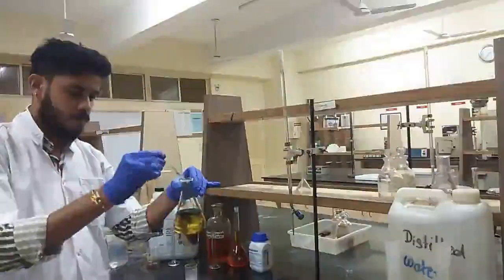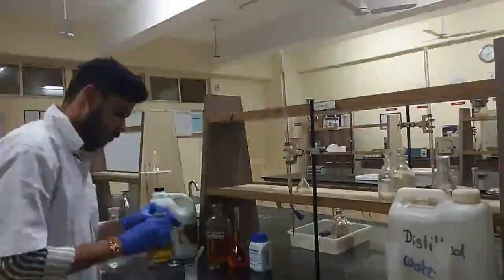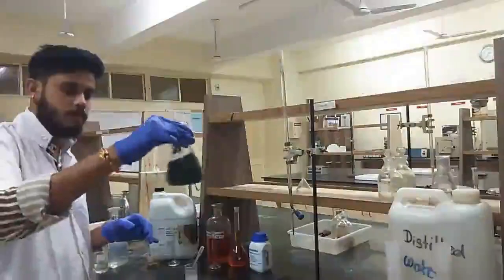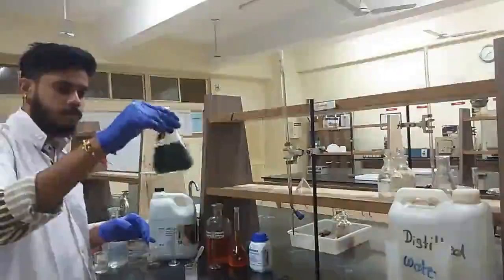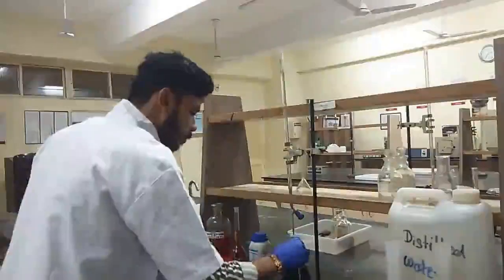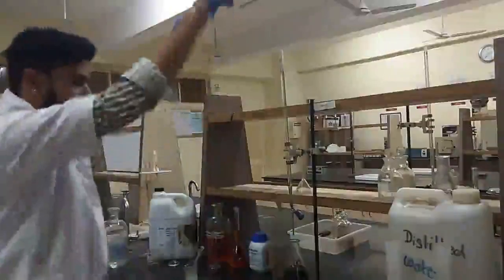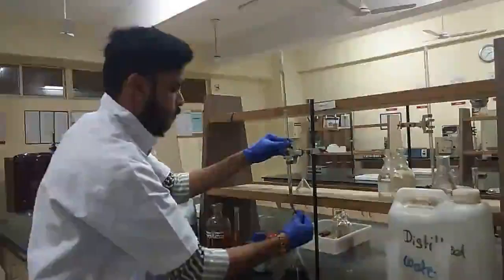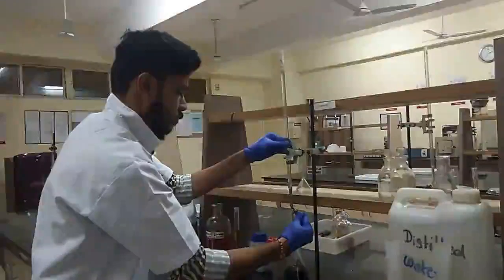Yeah, enough. So you will be seeing that a color change will occur and you will be getting a bluish color, right? The bluish color is obtained. Now what we are going to do is we are going to titrate this against the sodium thiosulfate in the burette. The drop by drop addition of the titrant and simultaneous stirring will be done.